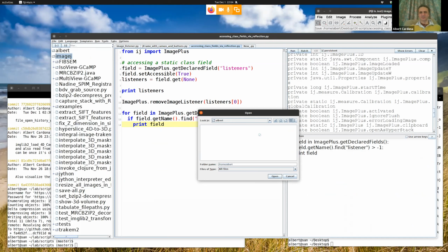Well, the demo gods have been invoked, and for the first time in my life, I cannot list my home directory in Fiji. How? Oh, there it is. What exactly is going on? It's beyond me.